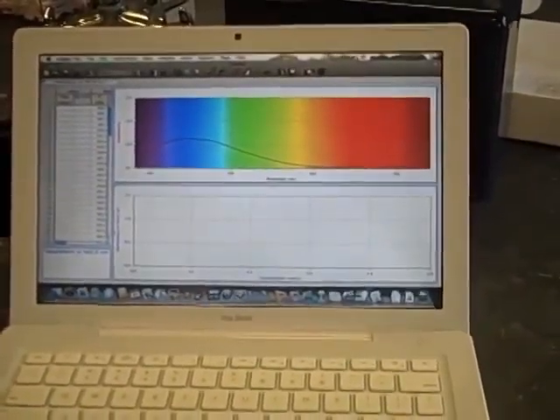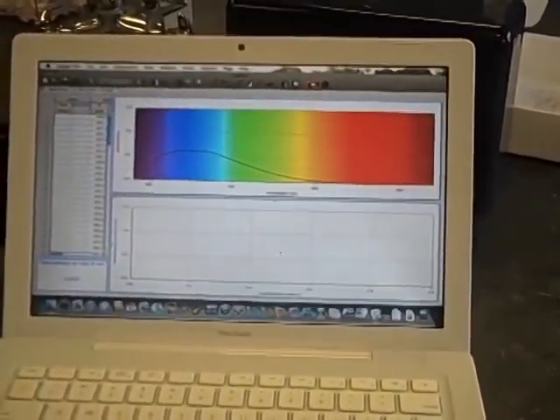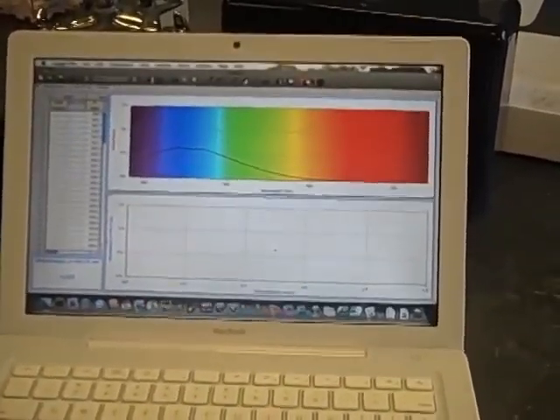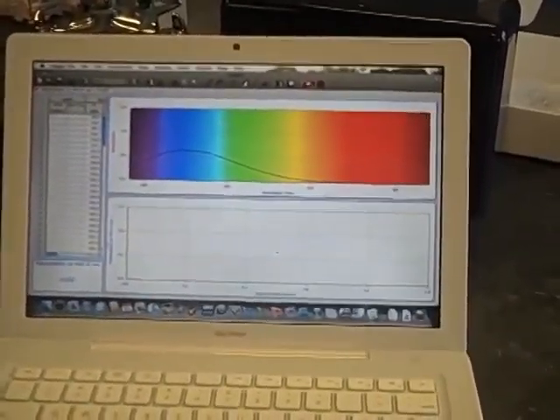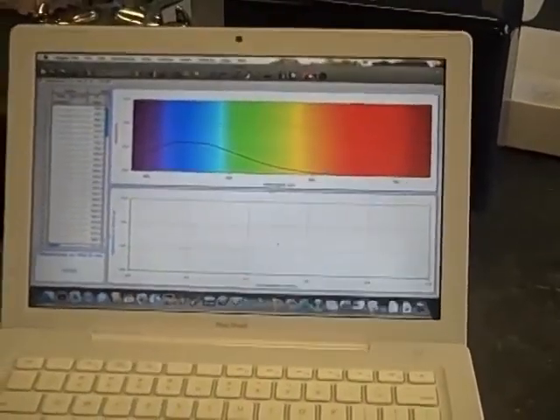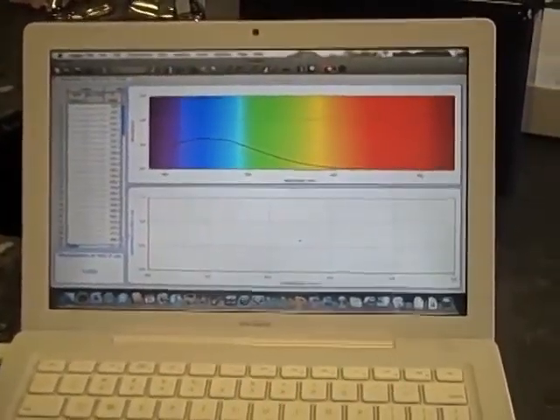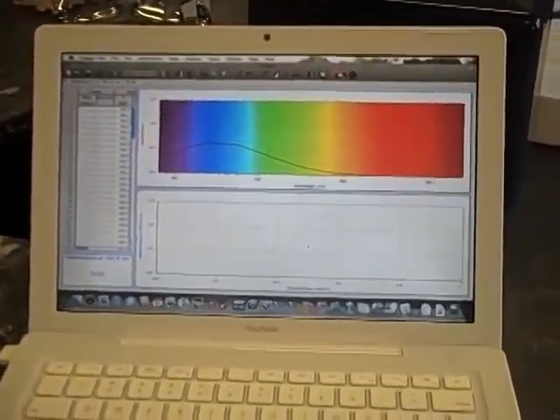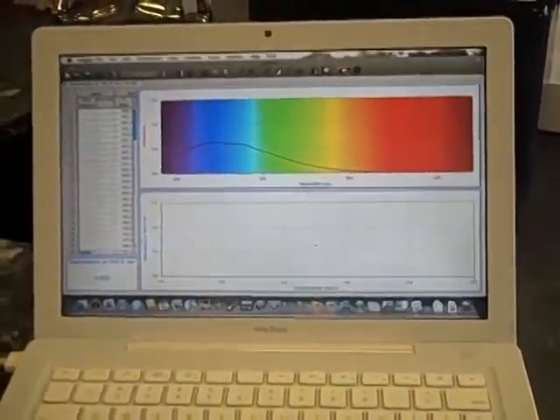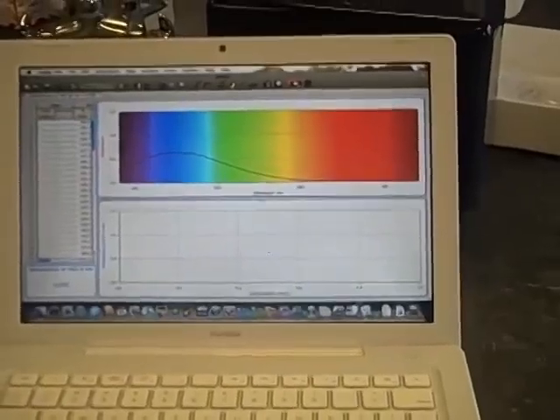Good point. And you know, I noticed that the iron solution is a golden color, but the maximum absorption's in the blue. And that kind of makes sense that it's absorbing the opposite of what it's reflecting, isn't it? So this lab really does more than equilibrium and absorbance of concentration, but now we also know the wavelength in which this iron likes to absorb.